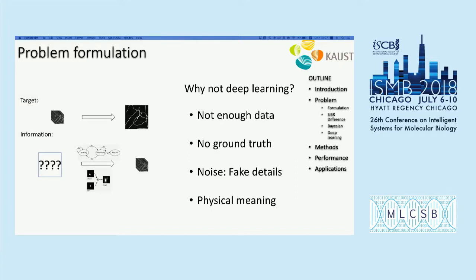And even if we somehow get the low resolution images and also the target of the deep learning model, the training process is not that straightforward, because previously deep learning models were always dealing with noise-free natural images. But now our image is highly noisy, which means the result of our model may have a lot of fictitious artifacts, which we need to deal with. And even if we finally overcome these three obstacles, the method itself may still have some problems. The biggest problem is the deep learning problem itself.